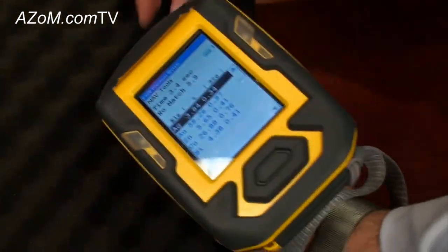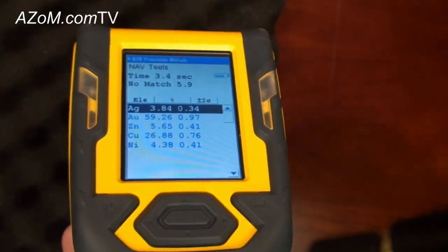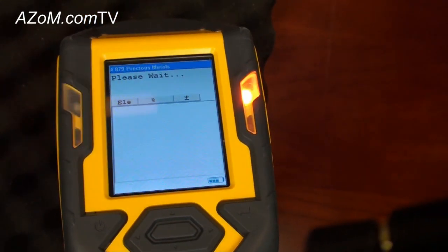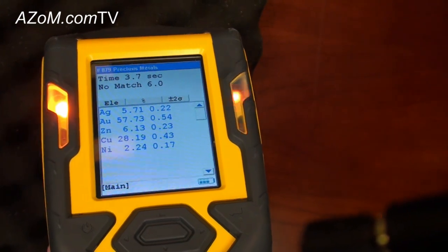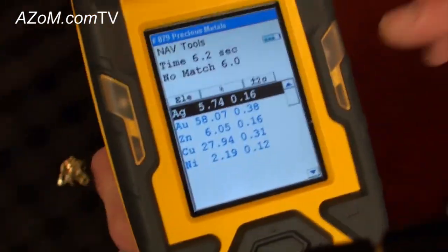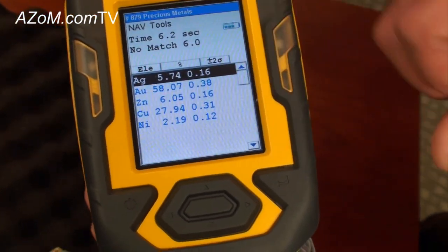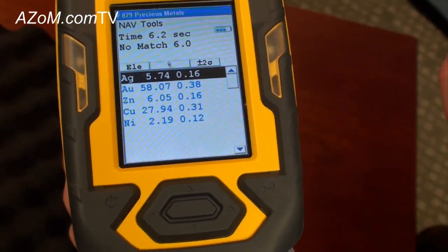It's as easy as placing the instrument back on the sample, squeezing and holding the trigger, and in a few seconds we can see pretty clearly that this is also 14 karat gold with 58% gold. It's got a little bit less silver.